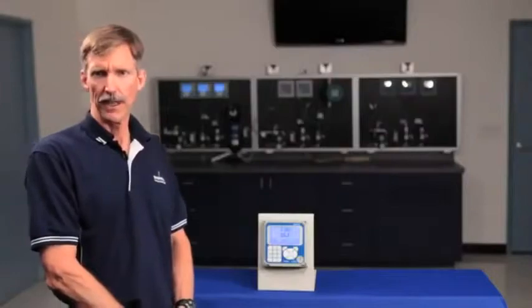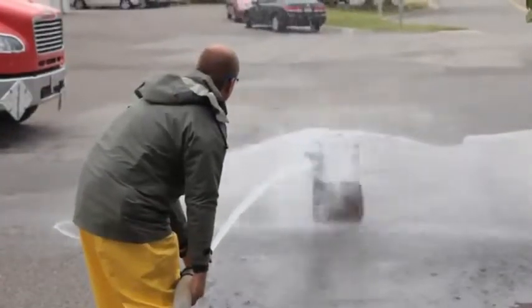Even after the impact test and the firehose water blast test, you can see that the unit still maintains its NEMA 4 watertight rating.